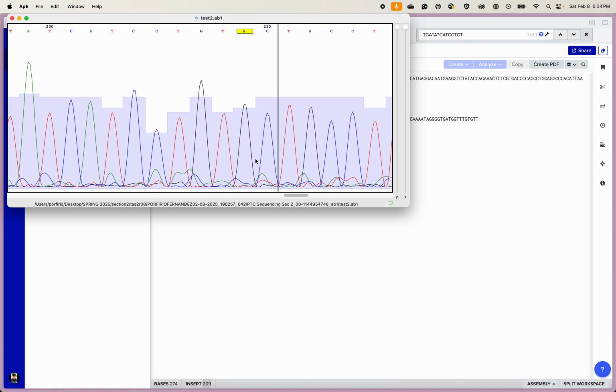So this is how you know, and you can write about this in your report. And actually, there's a spreadsheet where you're going to write your genotype for the sequencing experiment, the genotype for your restriction digest, and whether or not you actually taste the compound. All right, so that's one. Let's do another example. Let's close out of here.